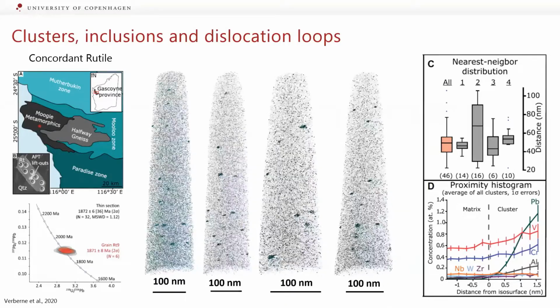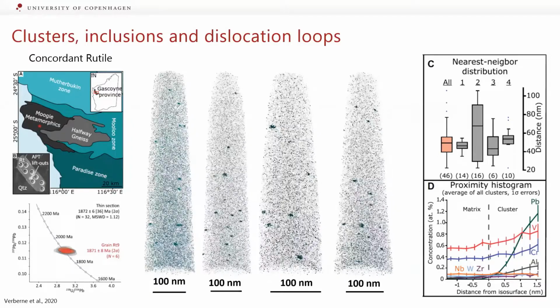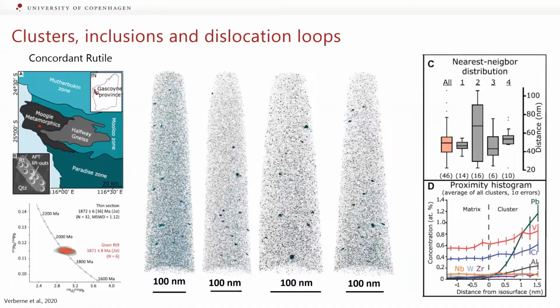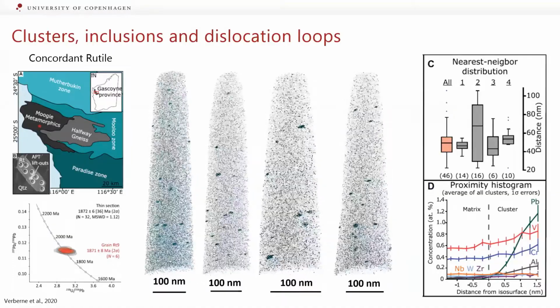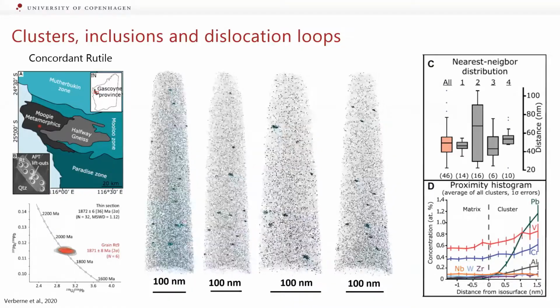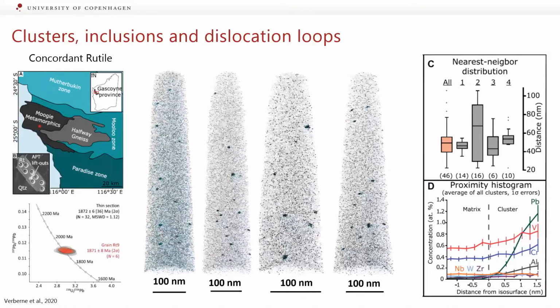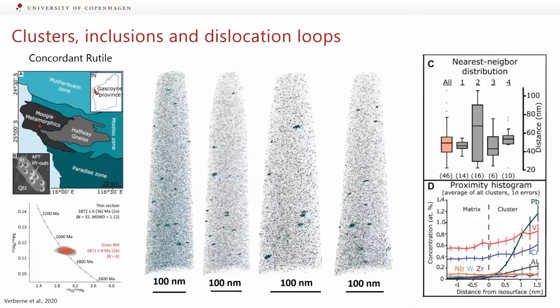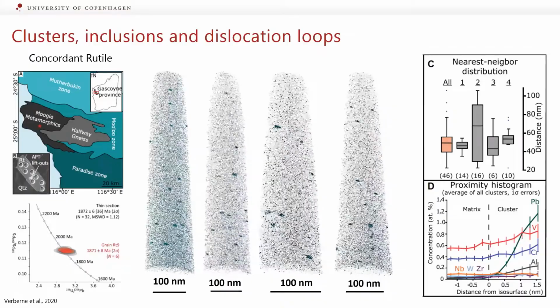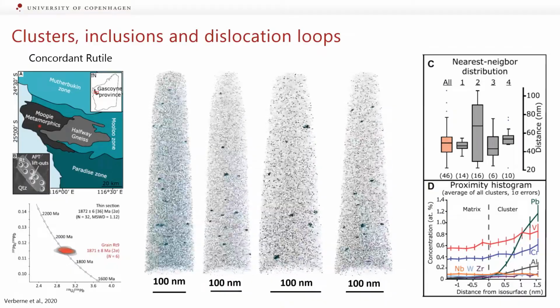And one technique we used to analyze these is to do a nearest neighbor distribution to see something about the processes by which they formed. Because the lead comes from the uranium decay, that creates alpha recoil. And so if this is such an event, you would expect that there's a maximum amount of distance or minimum amount of distance that you can have based on that energy that releases. Now, since this doesn't fit, we assume that it's more in situ and it's in place of where the final uranium to lead transitions takes place.